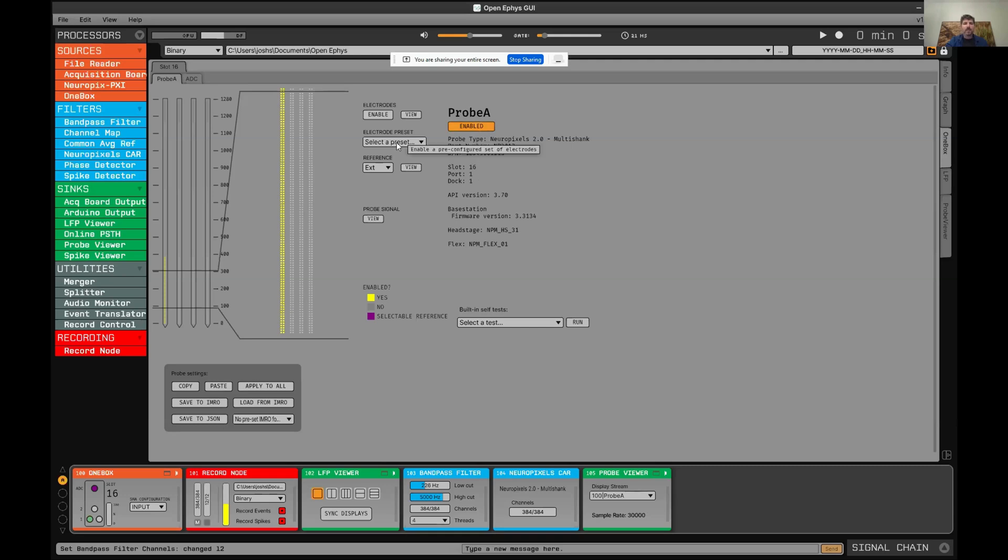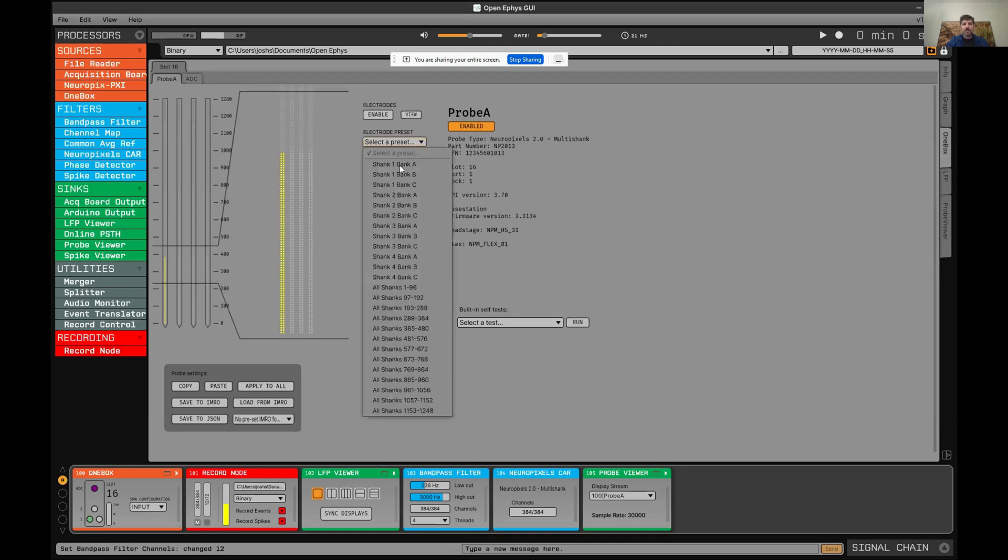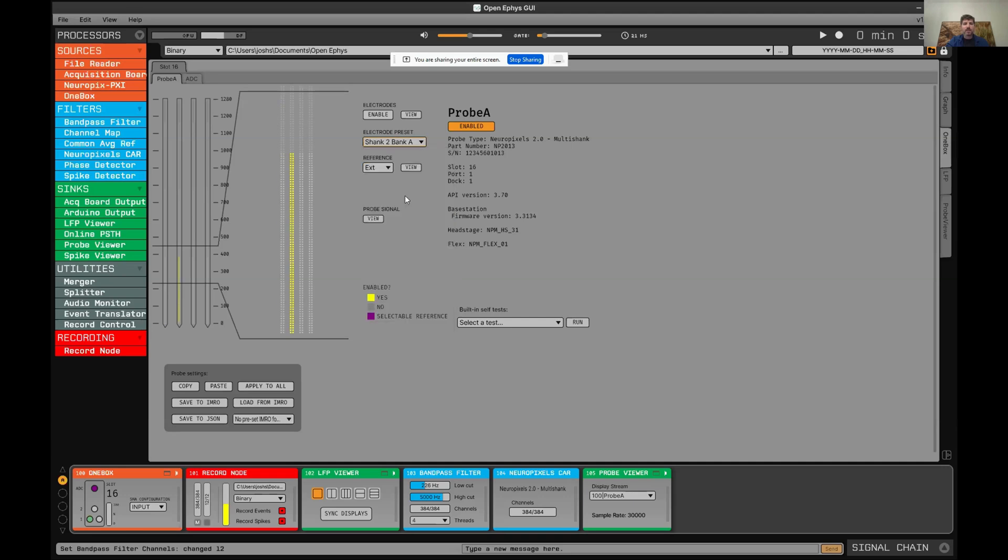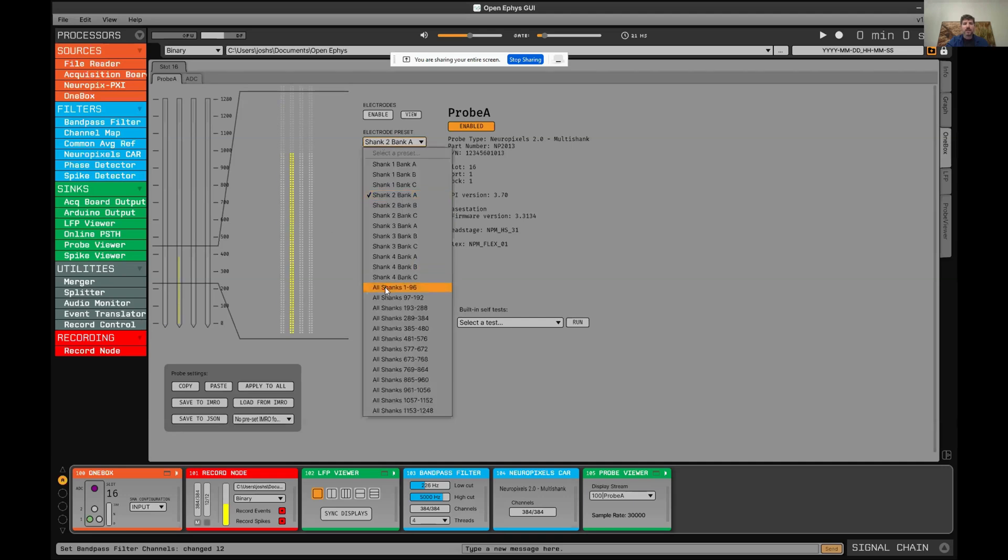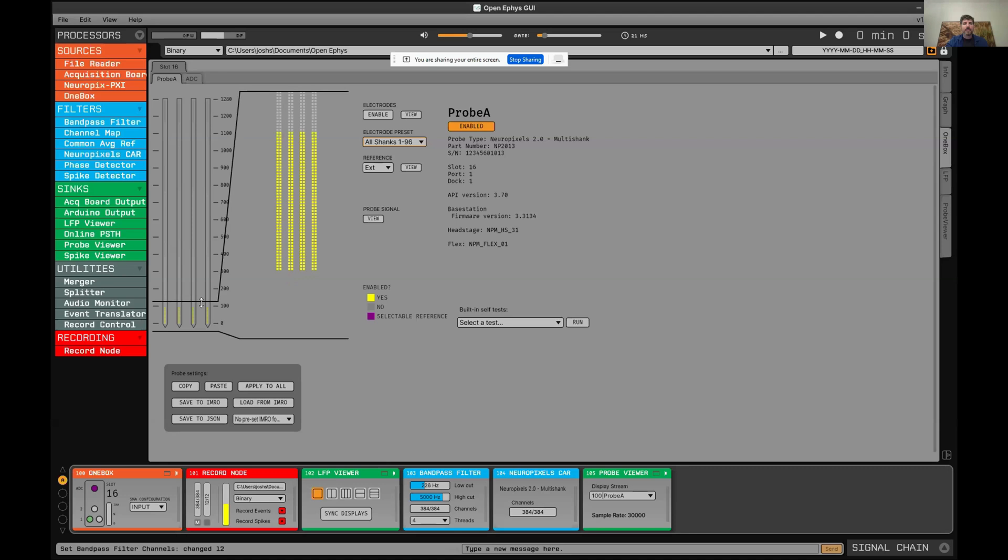Here is a little overview of the probe. You can use this electrode preset dropdown menu to change which shank is selected or select a group of channels across different shanks. You can also click and drag on different sites in order to enable them.